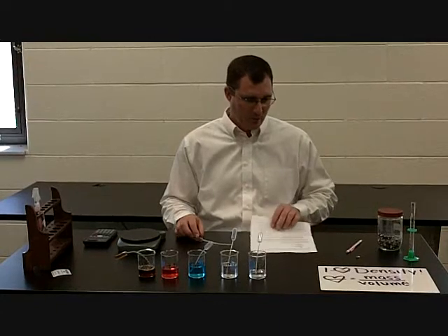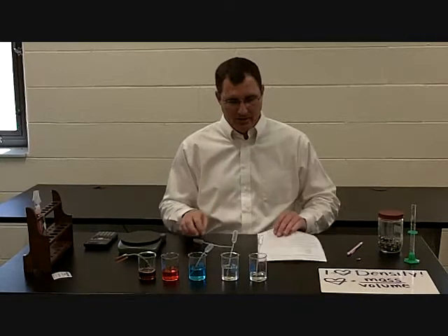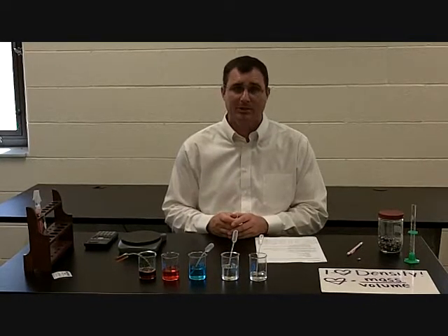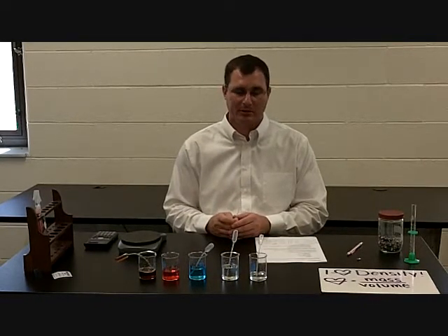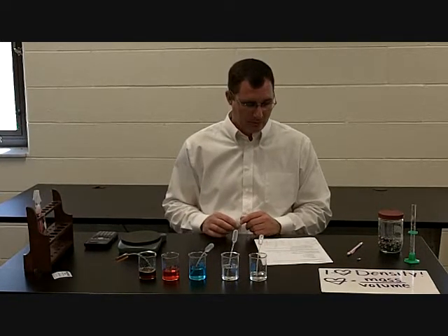Hi guys, and we're going to go over the densities of 5 liquids lab. It's another lab that just helps us talk about densities and gain a better understanding, but it's a really fun lab to do. So let me go through this with you.